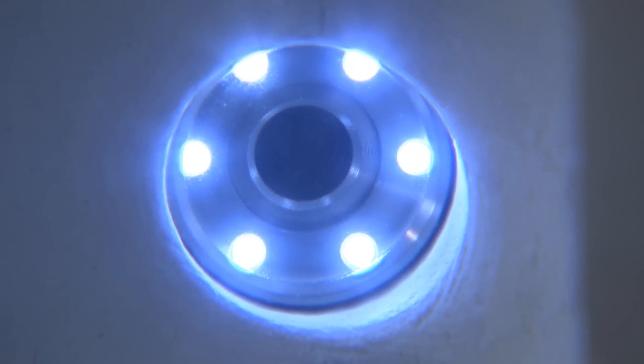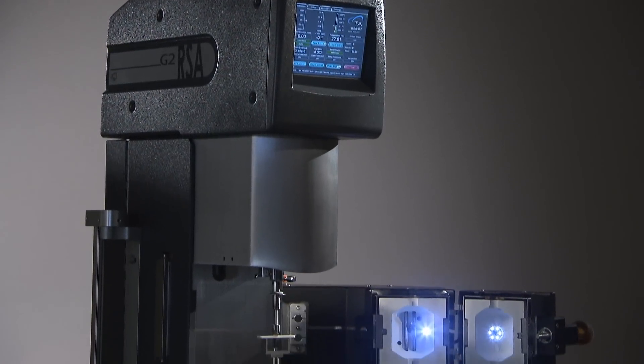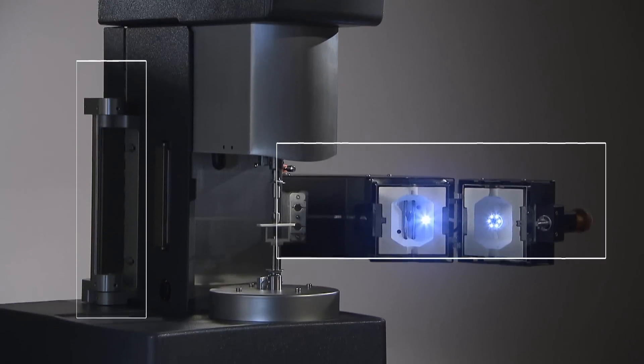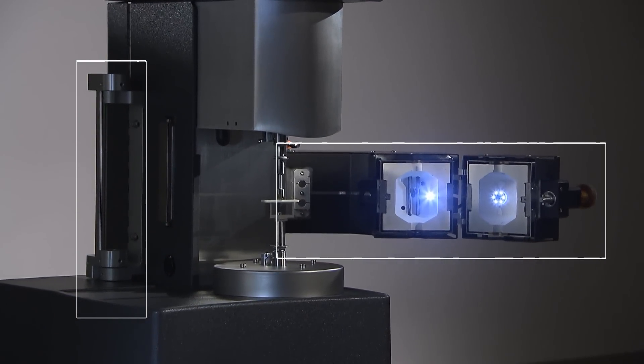Additional FCO features include a window and internal LED light. The oven can be installed on either side of the instrument and can be conveniently positioned with ample room for sample loading.